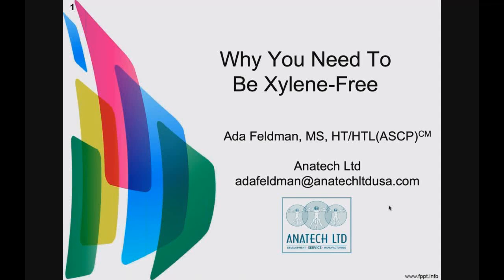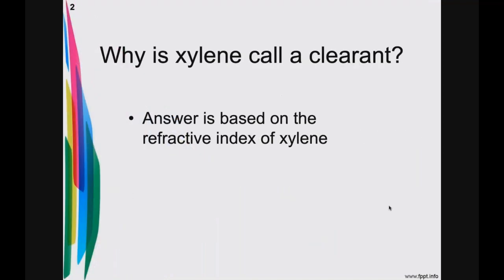So why you need to be xylene-free, or why you want to be xylene-free, is what we're going to talk about today. We refer to xylene as a general chemical. We call it a clearant, all right? And there's been some discussion on the web recently on why xylene is considered that term. Why is it called a clearant?